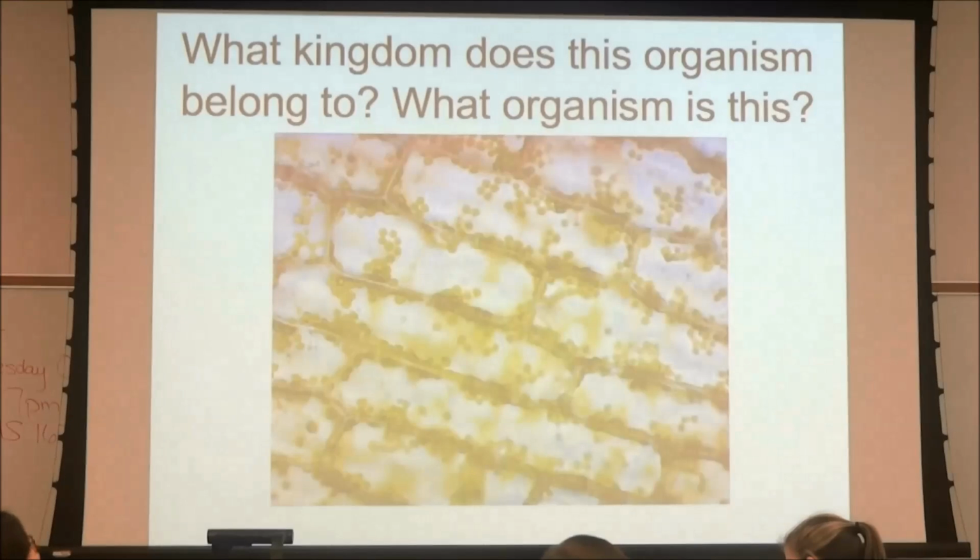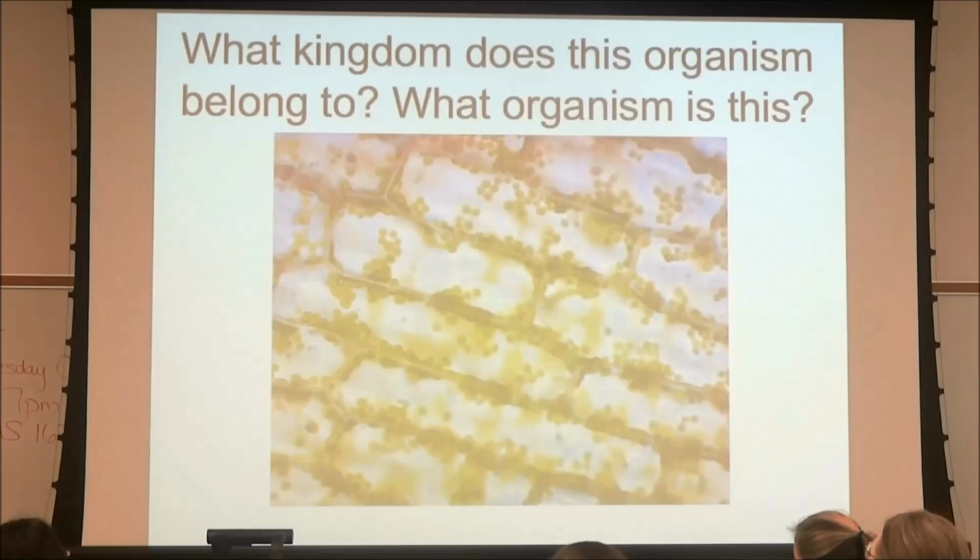So, can you guys tell me what kingdom this is and what organism it is? It's a plant cell. Is it the onion? It's not the onion. Is it the sheep? No, it's a plant. It's the leaf. Yeah, it's the Elodea. Is that the leaf?